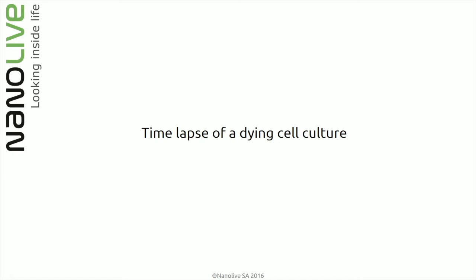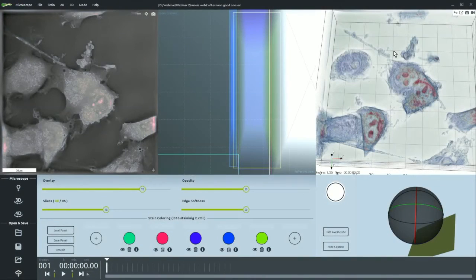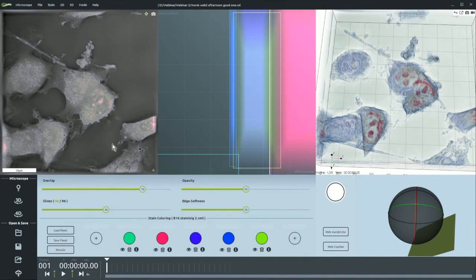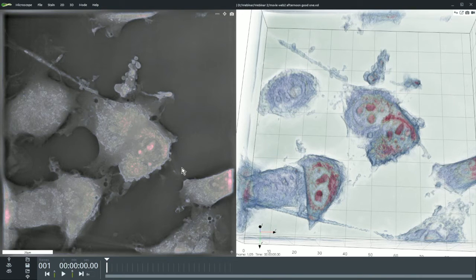Now that we're done with the examples, let me show you the result of the time lapse of our dying cell culture. Here we are in STEVE, and I'll leave you to watch this for a couple of minutes while I collect your questions.